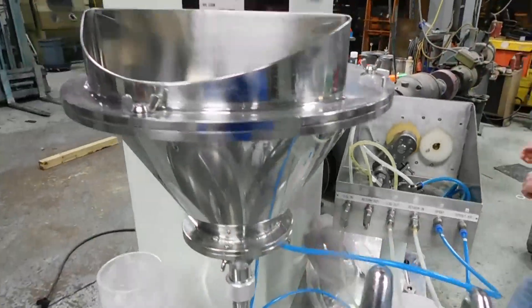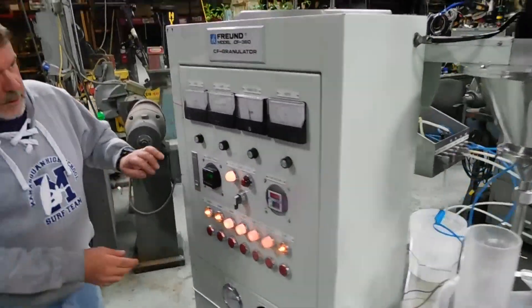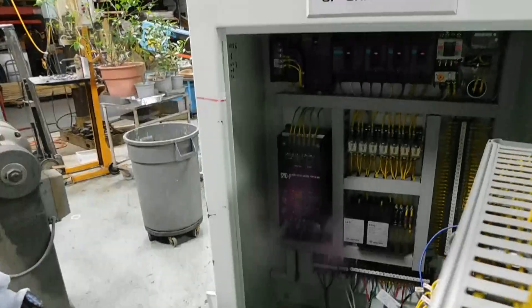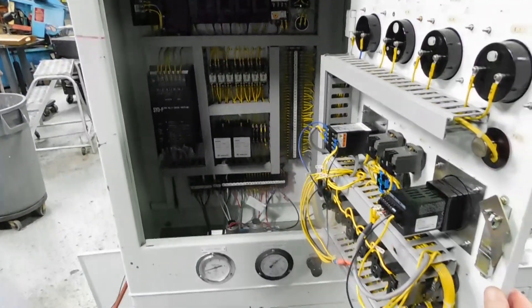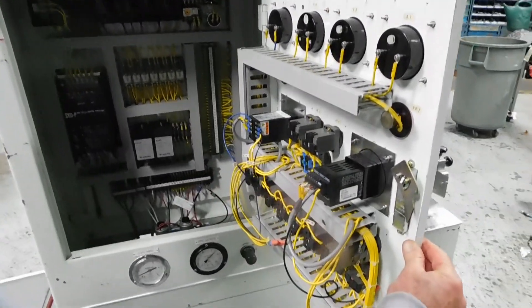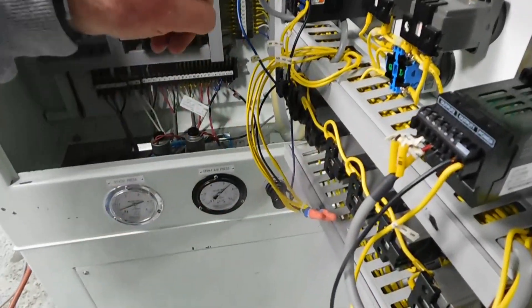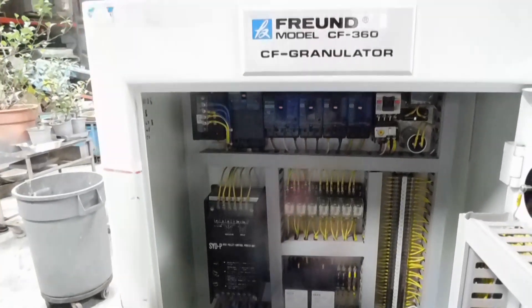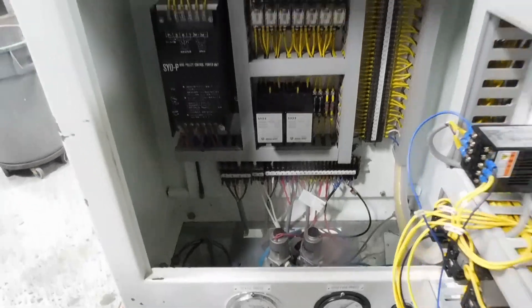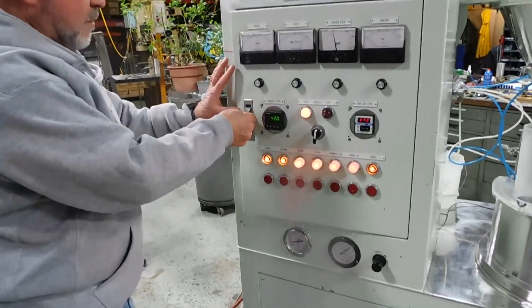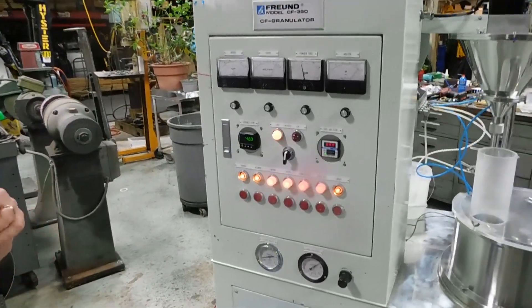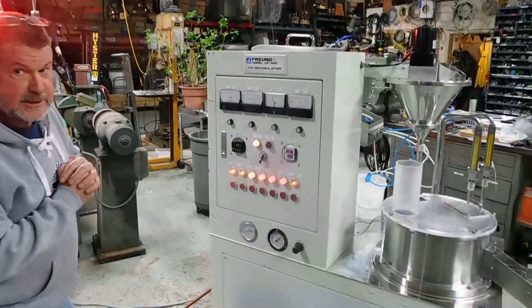The controls are in great condition. Everything's wired accordingly. We believe this may have been part of the old temperature control, which they replaced with the solid state Omega controller you're seeing on the outside. These are your air solenoids on the bottom in here for the spray controls you see out here. It's pretty simple. We've actually never had one of these before, and in about an hour we had it figured out. We do know how they operate, of course, and how they're supposed to operate, so that's a little bit of a help as well.